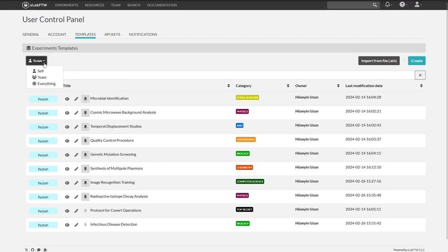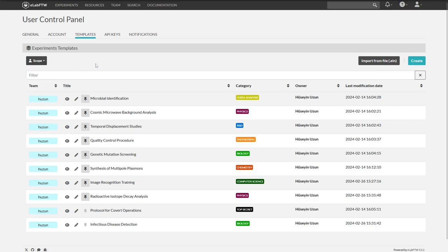Our scope is currently set to self. We could also set it to team or everything to see more templates that are shared with us. Let's stay with self for now.